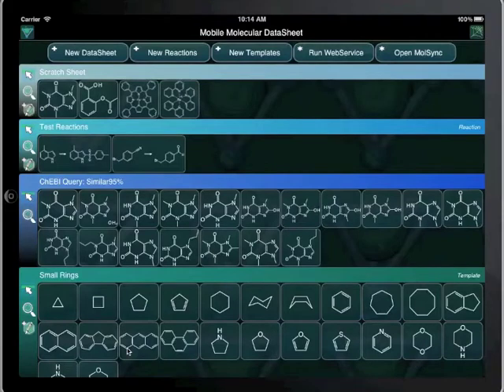In this demo, we're going to show how to use the template library to draw an oligo-peptide structure.